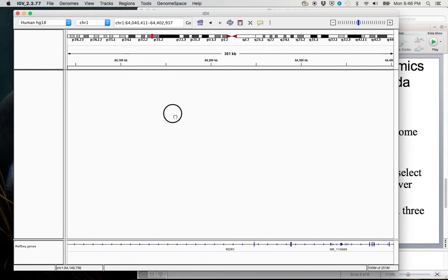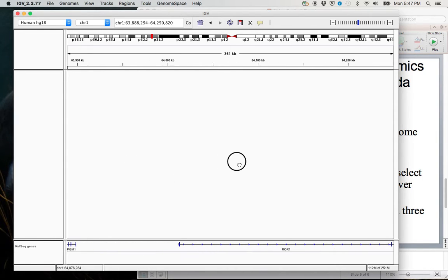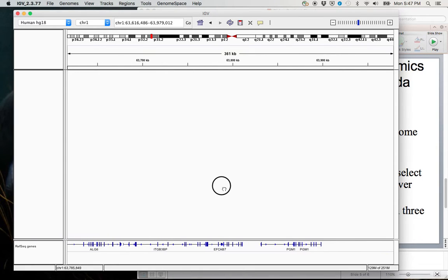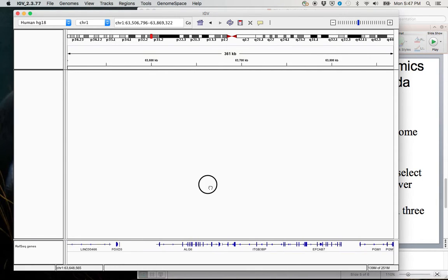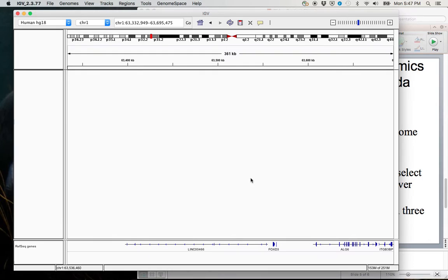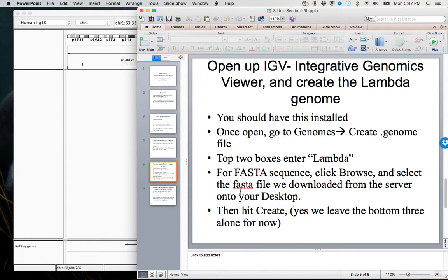And in fact, this file here, these RefSeq genes, that is a GFF file. So if you remember when we were looking at example GFF files, this is what that translates into.